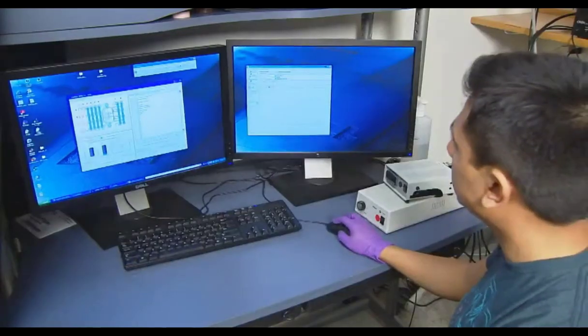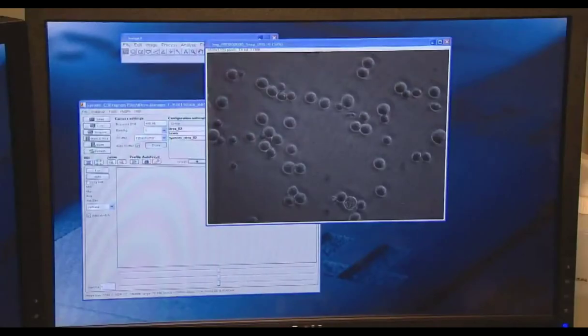We're interested in how cells respond to heterogeneous environments. So typically when we do things, we change media, but it has both input 1 and input 2 there. But we want to see what happens if we have input 1 on one side of the cell and input 2 on the other side of the cell, how does it integrate that decision? And is it integrated differently than when the cell is faced with a mixture of those 2 inputs across the whole cell? On some level, nothing that we discovered we probably couldn't have discovered with a lot of hard work in another way, but it allowed us to really test some things out and cleanly answer some questions that would have been difficult otherwise.